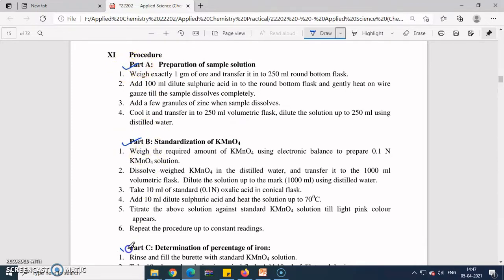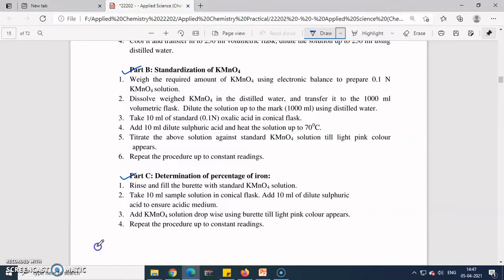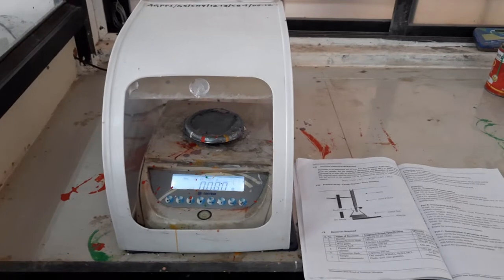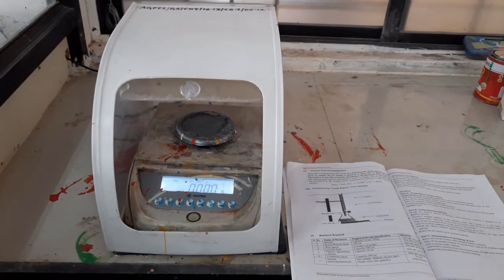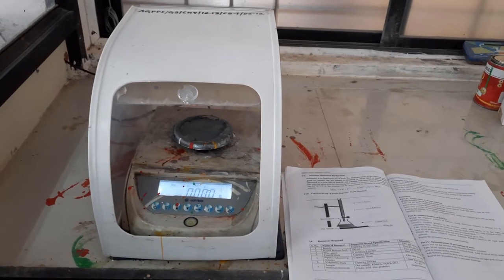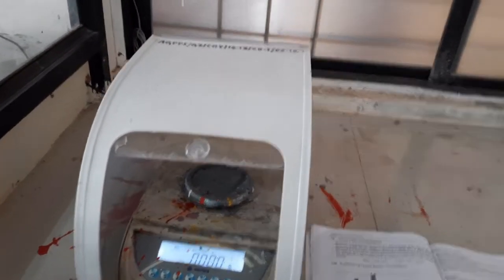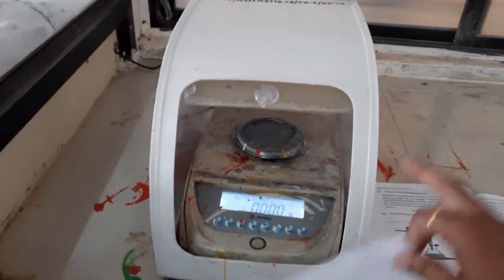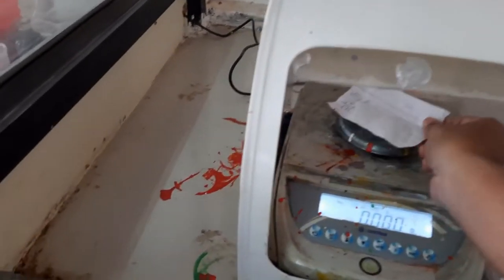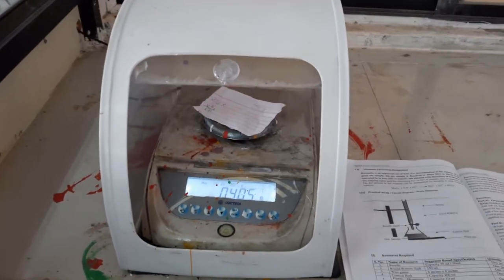The procedure is divided into three parts: Part A — preparation of sample solution; Part B — standardization of KMnO₄; and Part C — determination of percentage of iron. We will now start with Part A, the preparation of sample solution. For that, we need this electronic weighing balance.